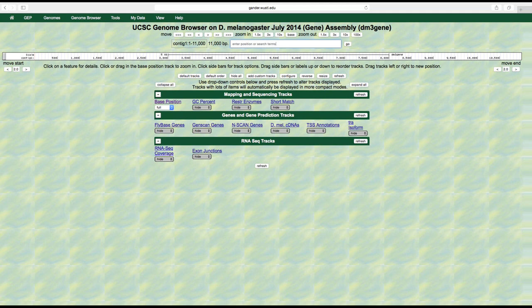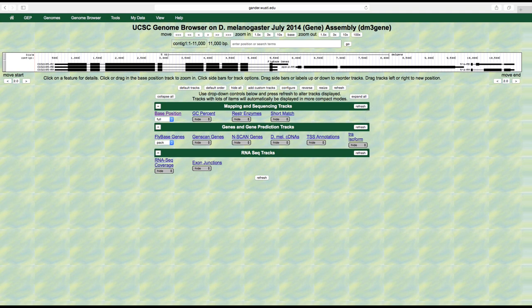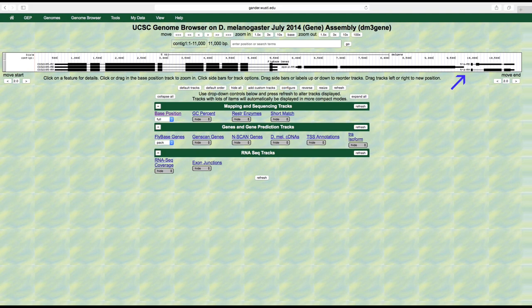Let's turn on the fly base gene track to pack. This shows us the location of genes as indicated by boxes and lines. The names of the genes are located to the left of each graphical representation of the gene, with the gene name shown to the left of the hyphen. This shows us that there are three genes in this region of the genome: CG32165, SPD2, and TRA. For these modules we will be spending most of our time learning about the TRA gene.